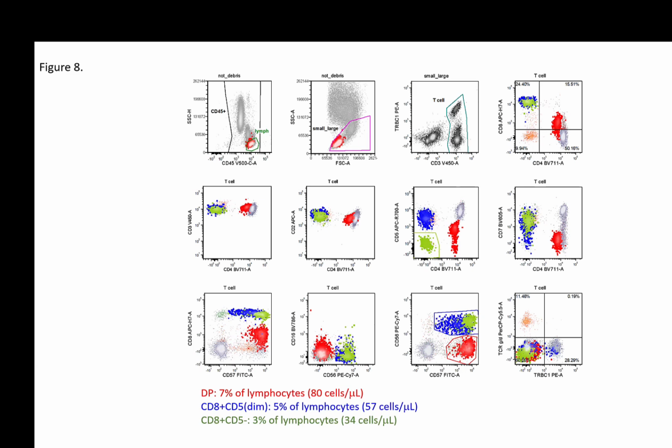Yeah, great. This is a wonderful example of that concept. Thanks for sharing this case. It sounds like it's not just about finding a T cell clone when you're evaluating this data, but also thinking about the immunophenotype of the population, the context, and the number of monotypic cells that you see. And I think this is something that we see all the time. Now, what do you do in terms of reporting? How do you report a case like this?